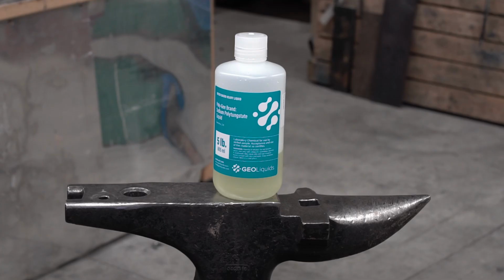So you may be asking yourself, okay, that's cool, a liquid that's about 3 times as dense as water, but you also might be asking, why? What's the purpose of it?